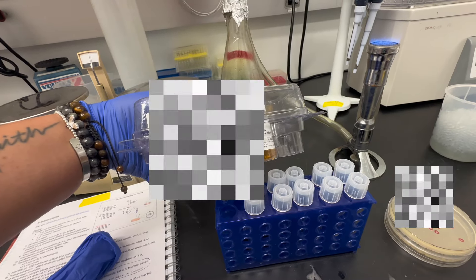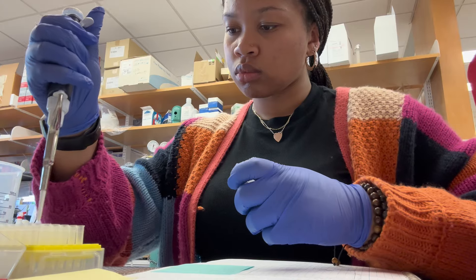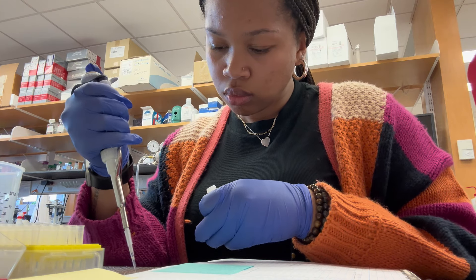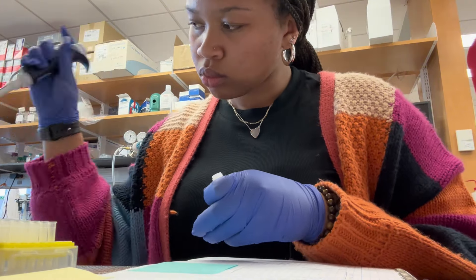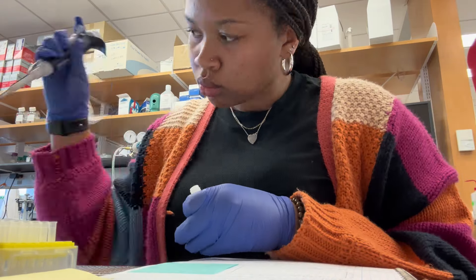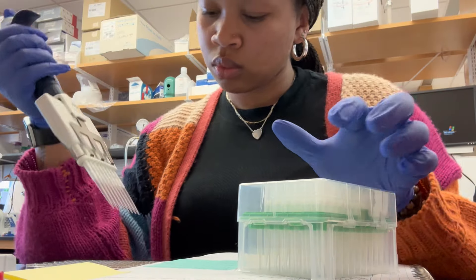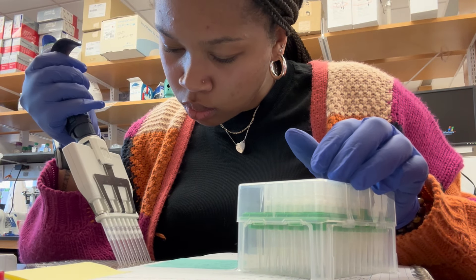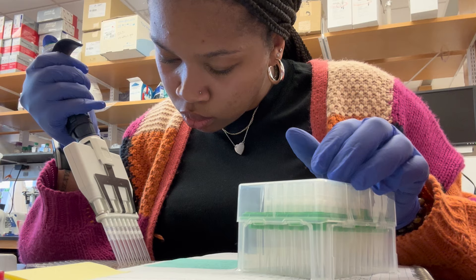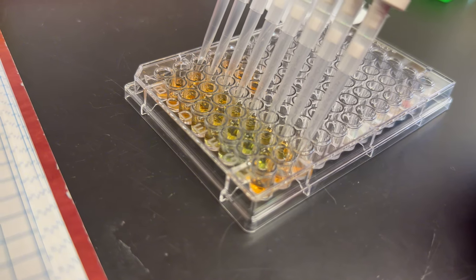Alright y'all, so I'm in the second part of my experiment where I am picking colonies. I use this media, put them in a tube, and then they shake for about an hour. But while that's shaking, I have to do this assay just to determine the concentration of protein in my sample. This kind of took me a while, so I sped through it — very tedious, making sure I was putting things in the right place. This was also the first time I used a multi-channel pipette, and when I tell you this is literally the coolest thing ever — you can pipette the same amount at once, and everything's moving in sync. So satisfying to watch.